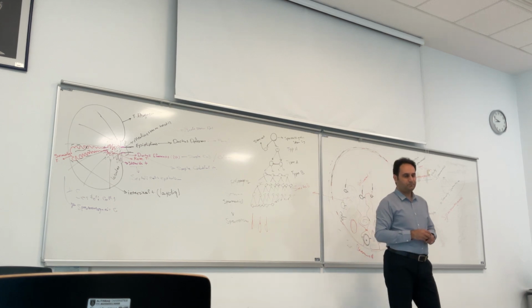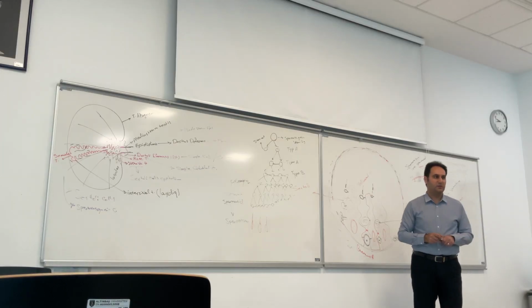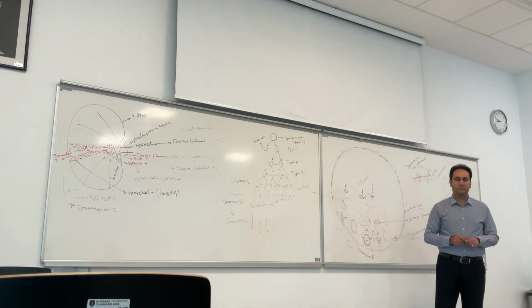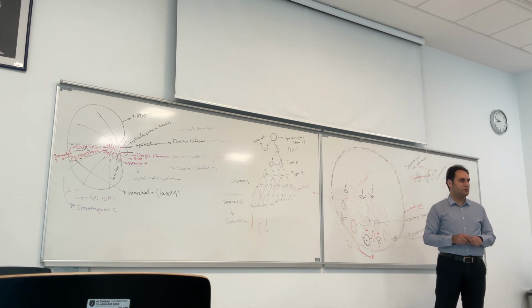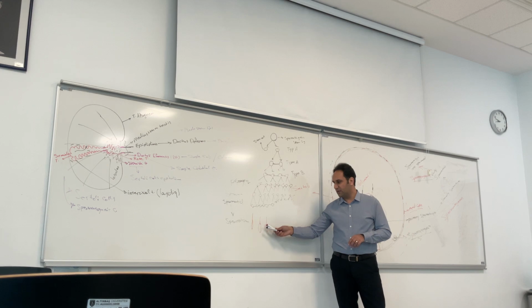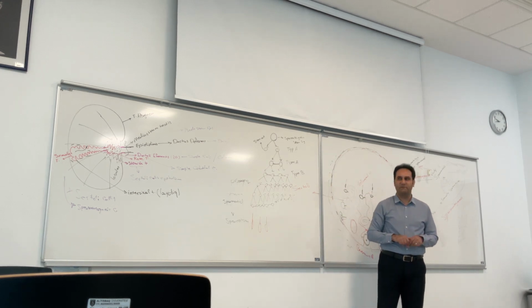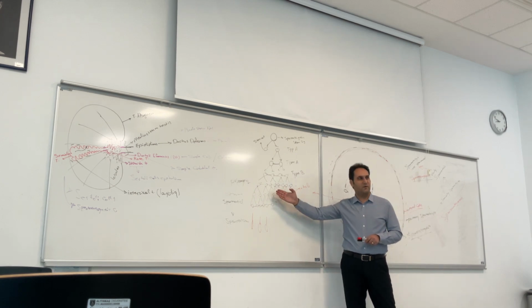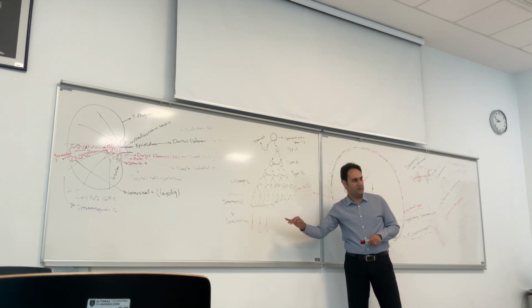The mitochondria form the middle part of the newly formed spermatozoa, and also centrioles migrate to the opposite side. One of them is present in this part, and one of them goes to the far side and forms the tail structure.